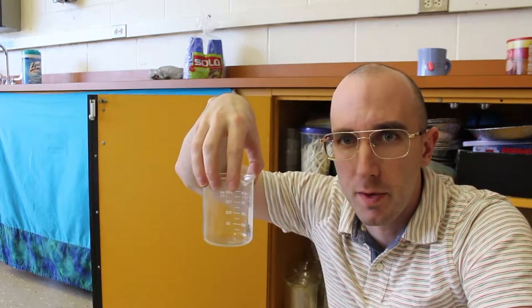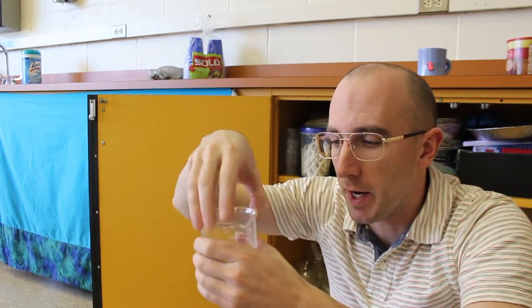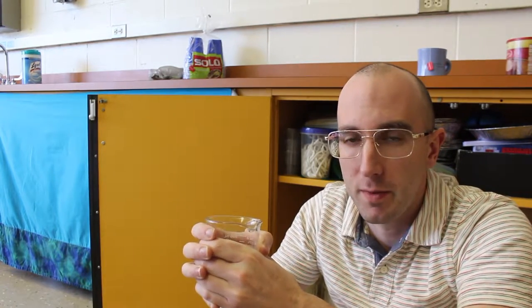When you're picking up and moving a beaker, be sure you're doing it in the proper way. Don't pick up a beaker by the rim — the grip is weak, you might drop it, and it might break. Pick it up by the side so you can get a firm, wide grip and hold on to it tightly and securely.